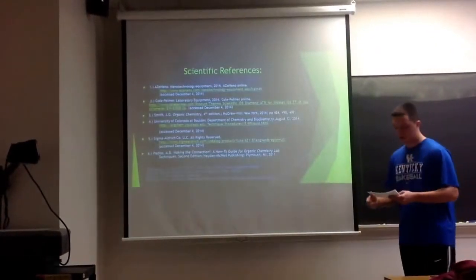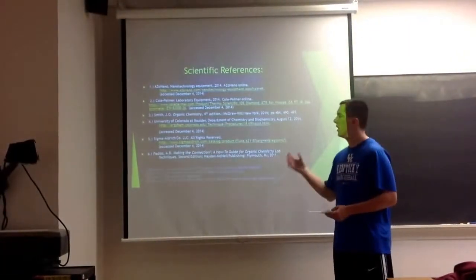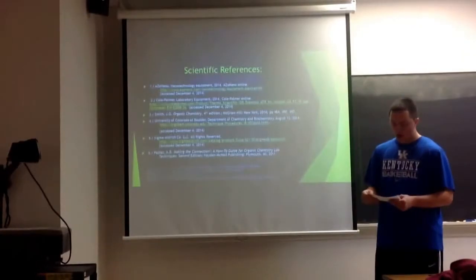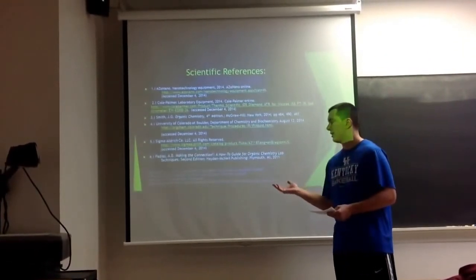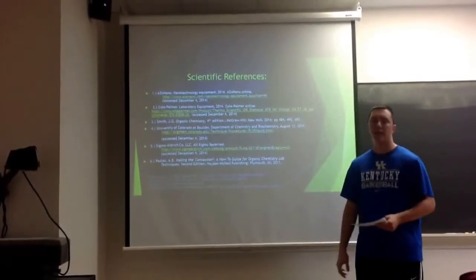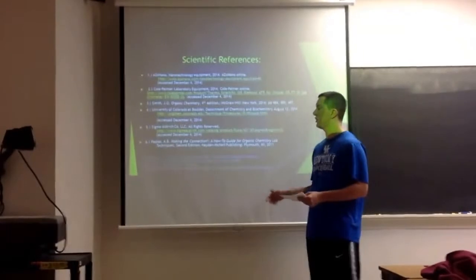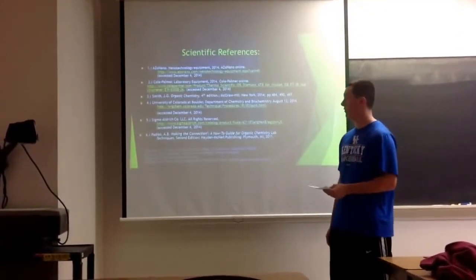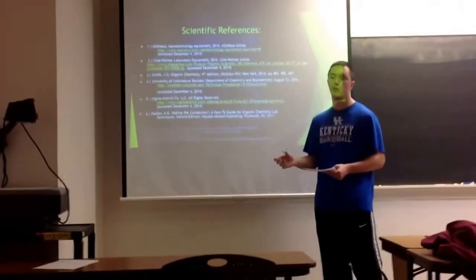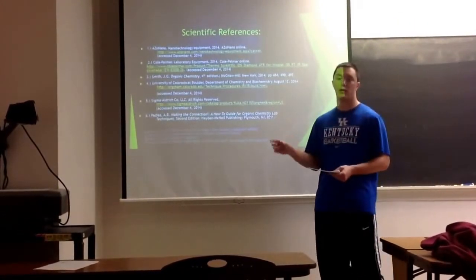Before I get to the references, I wanted to put some possible errors that could have happened within our experiment. I think when we did the IR spec on the solid with the ATR attachment, you have to make sure when you use the knob that you don't tighten it too much and it's not too loose. You want it tight enough but not too tight. And I think when we ran it the first time, it was a little bit too loose, and the spectrum was just haywire. So we ran it again. It was a little tighter.